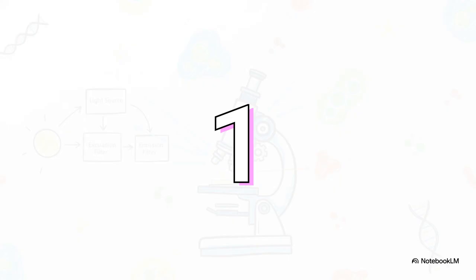And the timeline for this transformation? It's almost impossible for the human brain to fully comprehend. When scientists say there's a short delay between excitation and emission, we aren't talking about seconds. We aren't even talking about milliseconds. This delay takes mere nanoseconds. To your eye, it's practically instantaneous for sure, but in the realm of physics, it's a definitive, measurable gap where those high-energy photons drop back down to their ground state.